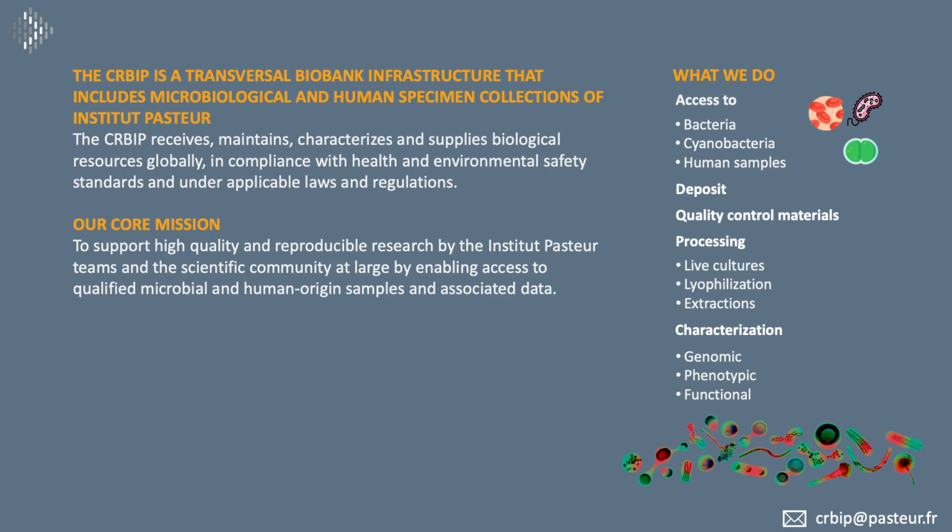Our processing methods include live cultures, lyophilization, molecular extractions, or cellular isolations. While our characterization methods include methods for genomic, phenotypic, but also functional characterization of the different types of biospecimens. I would also like to say that characterization includes methods for quality control in terms of authentication, viability, or integrity, and methods for high added value annotations in terms of antibiotic resistance or microbiome profiling, for example.